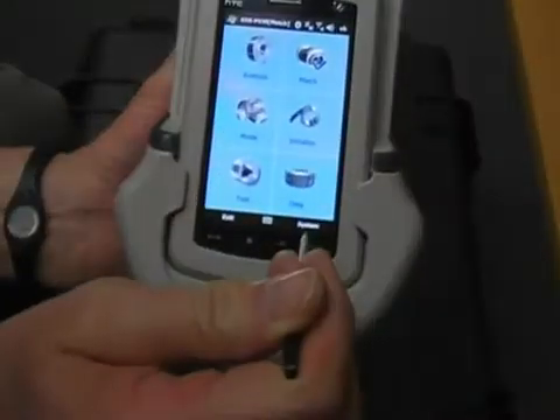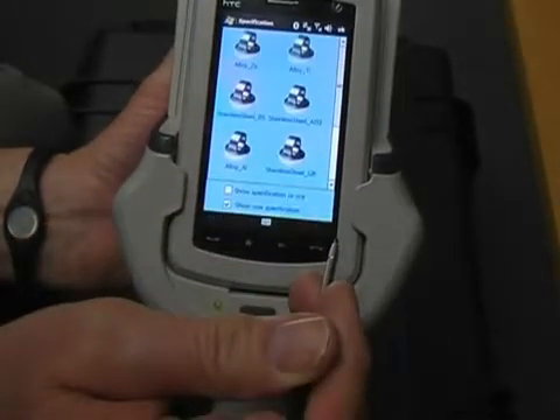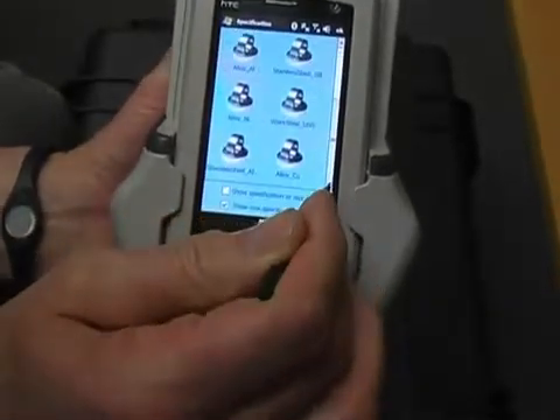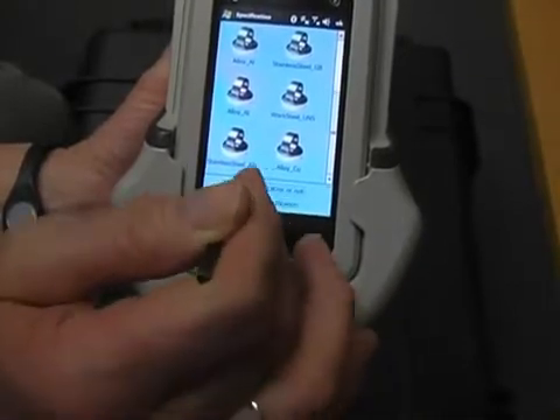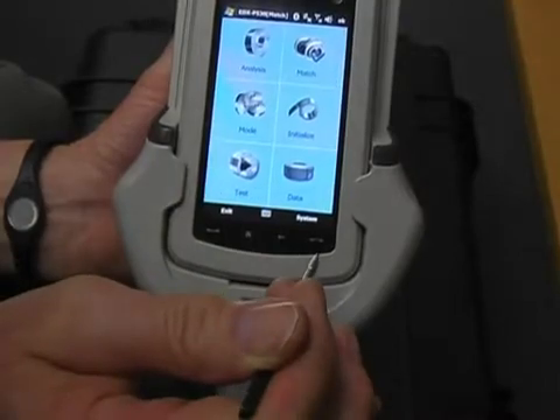We're going to do a match, so I need to select the system here — specification analysis. Scroll down and check this box here. Both check there and the stainless there.